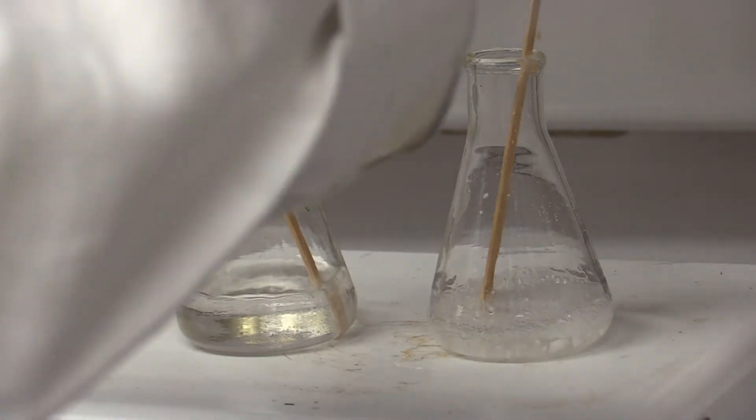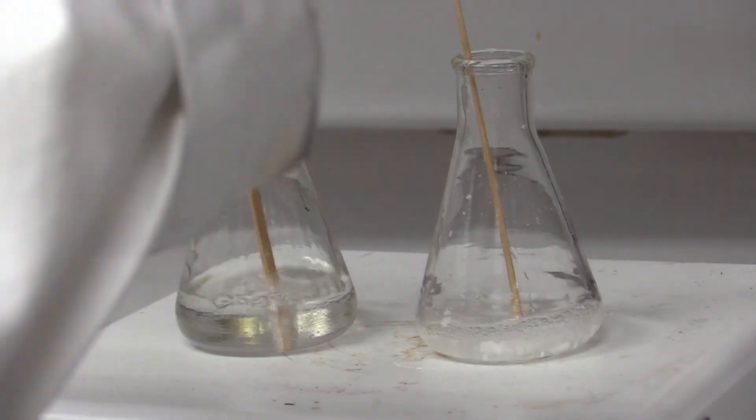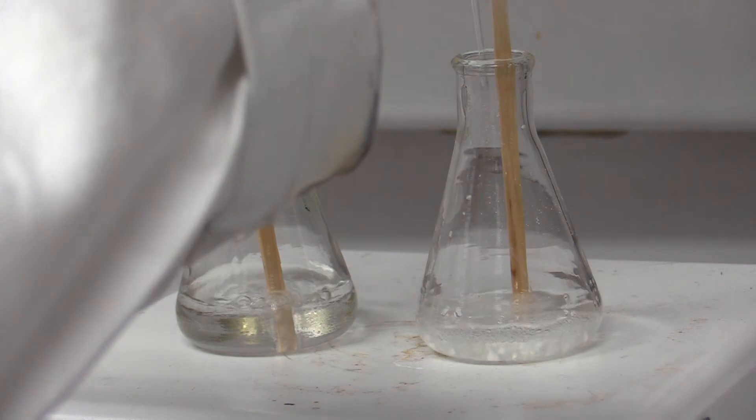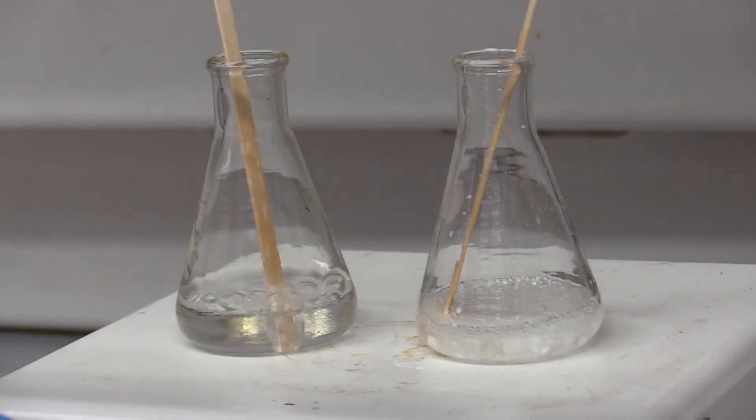When the solvent comes to a boil, slowly add the hot solvent to the cholesterol mixture. Be sure not to add too much. You want just enough to dissolve the solid. If you add too much, the amount of precipitate will be less, lowering your percent recovery.